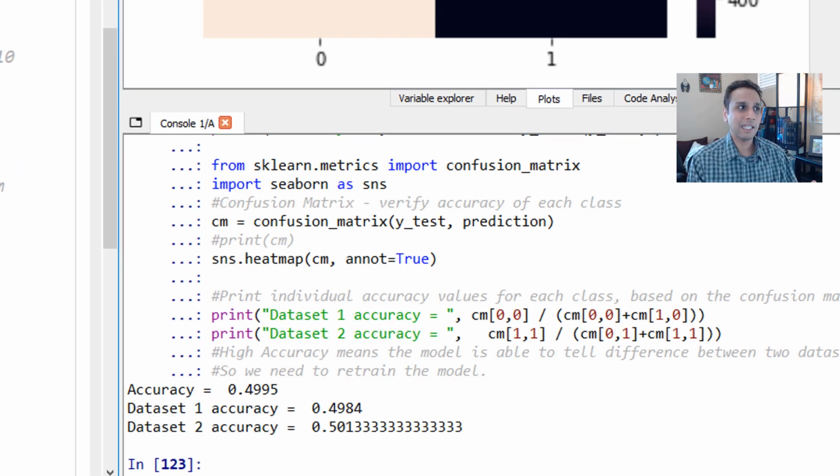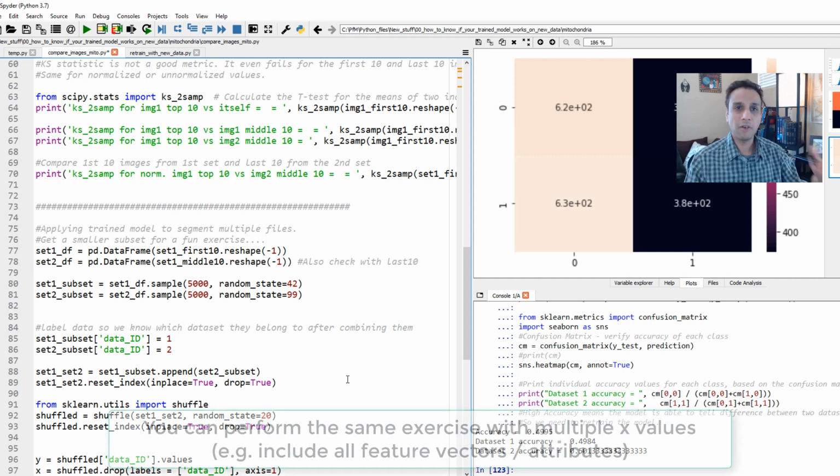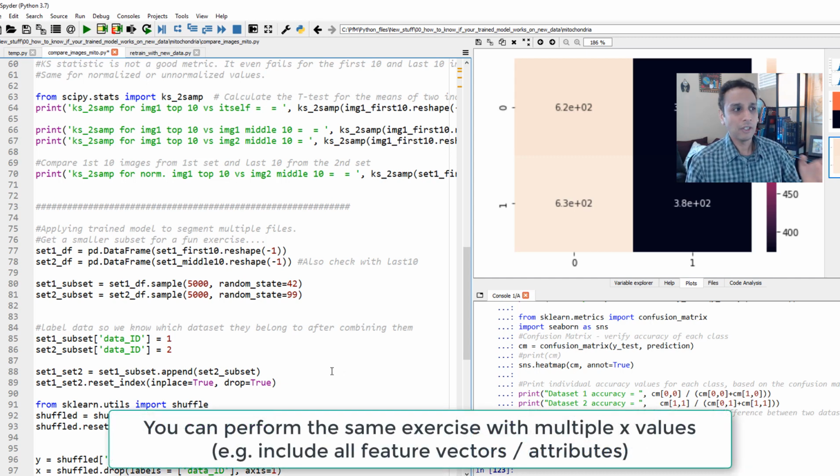That means my data set, even though I have 330 images, no matter where I pick, it seems to be doing good. Which means if I take some labels from that data set, train it, and then try to segment the entire data set or classify the entire data set, it does a great job. I know that for sure. Now the question is, how does it do on the other data sets, right?